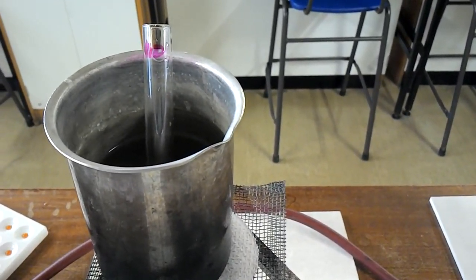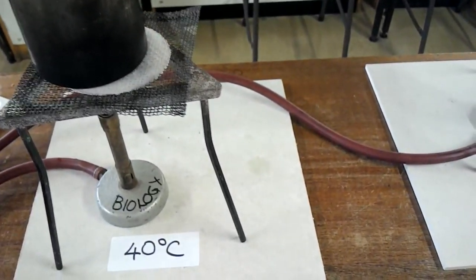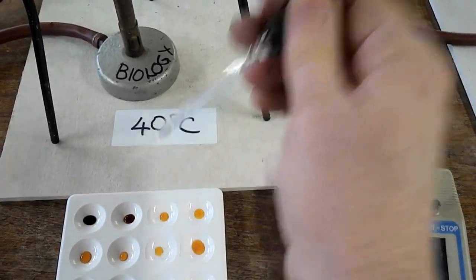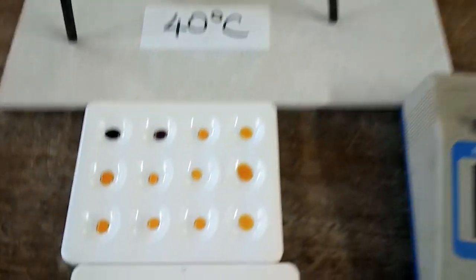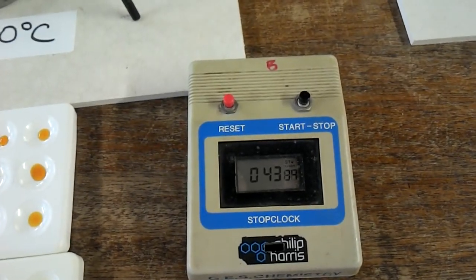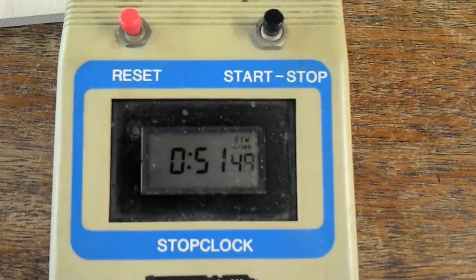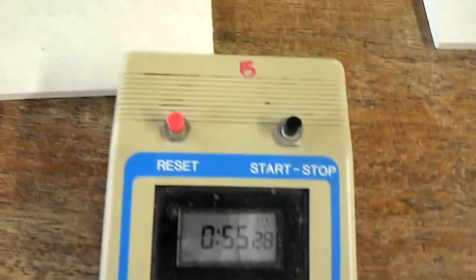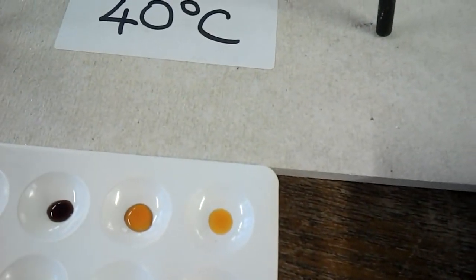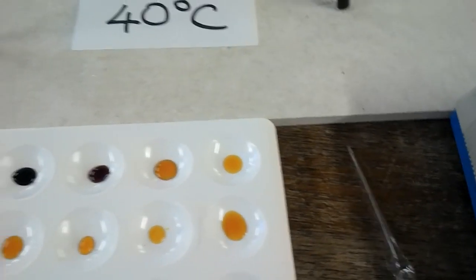Okay. After 30 seconds, we're going to take our next sample. Okay, time to take the next sample. In it goes, and we've got it starting to see a change already. Okay, you can probably see it's not quite so black. Okay, so we're now coming round to three quarters of a minute. You can start to get ready your sample just in the last 5 seconds so that you hit on time. There we go, and it's not changing. Okay, so we stop. So after 1 minute 30 we had no change, definitely. So one and a half minutes we record.